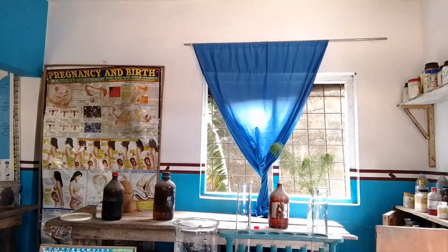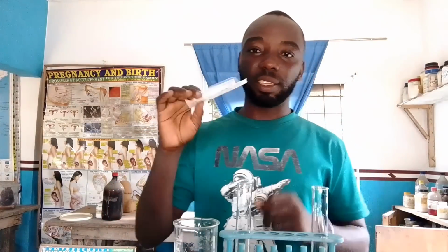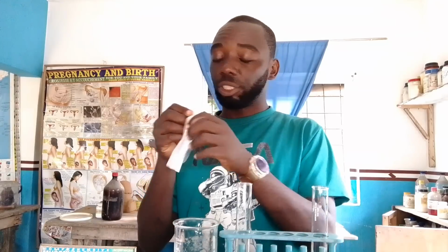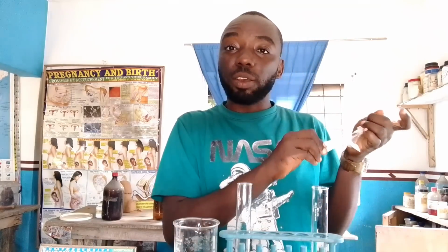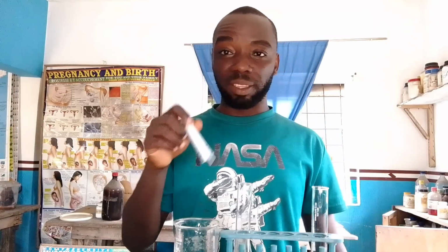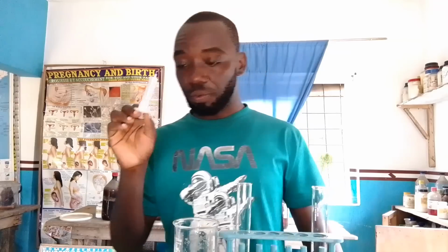Okay, if you check that instruction, we were also asked to provide a syringe. So here I have my syringe. The question will also be, why would they ask schools to provide a syringe? The essence of this syringe is for you to use it to take materials.